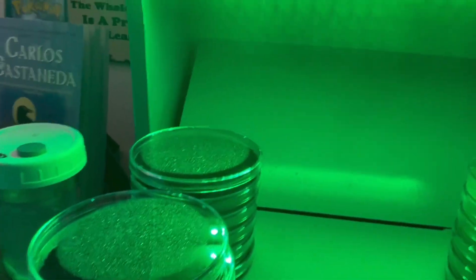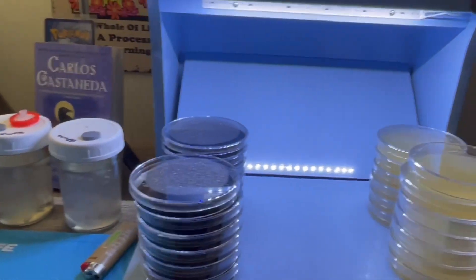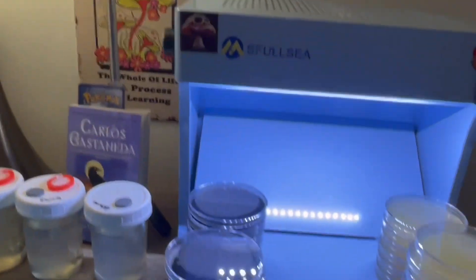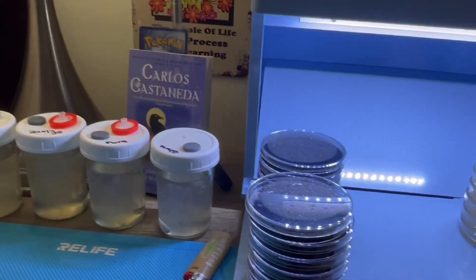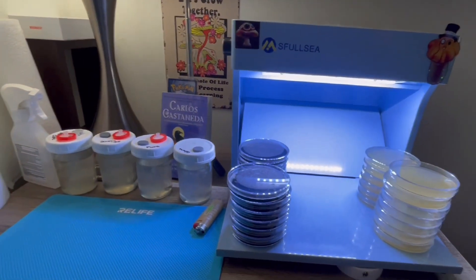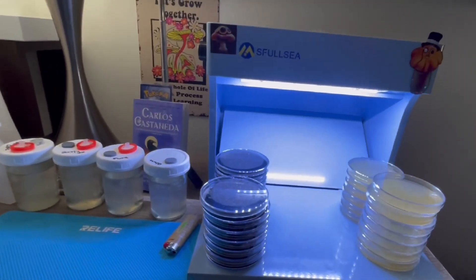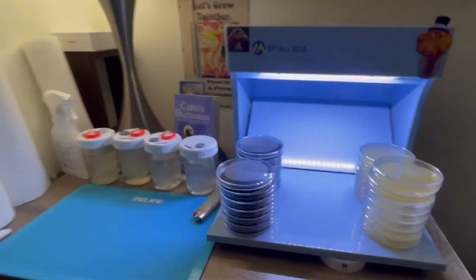I can honestly say I give this a five out of five. If you're broke like me, I would get one of these for sure — I'm about to get maybe even another one, put it right next to it, give myself another foot. It's about 180 bucks on Amazon, and you can't knock this product. It's good stuff. Shout out to Dave Wombat — all right guys, take care.